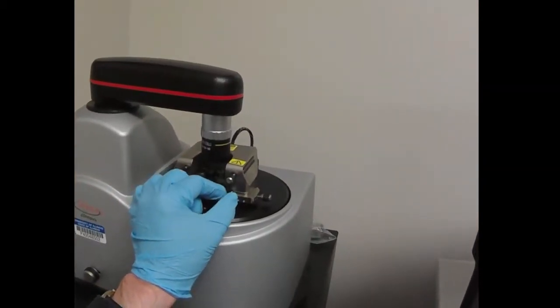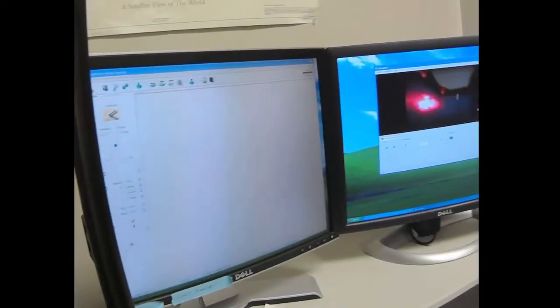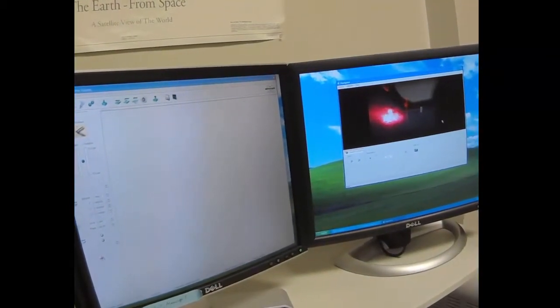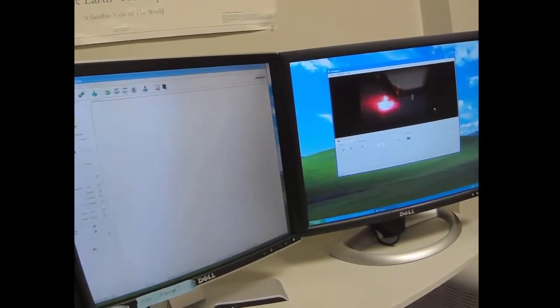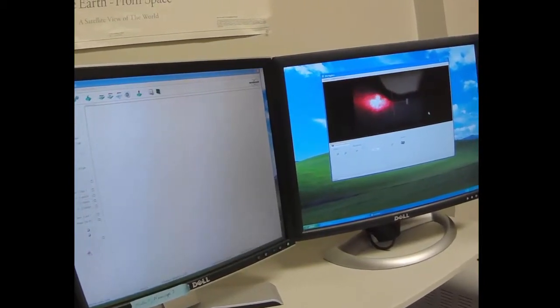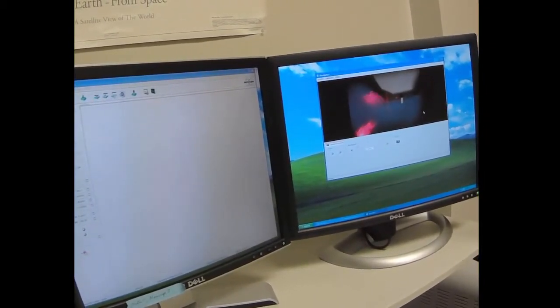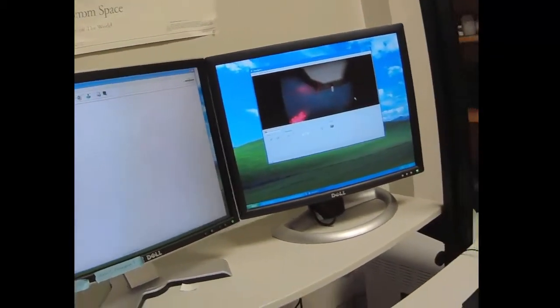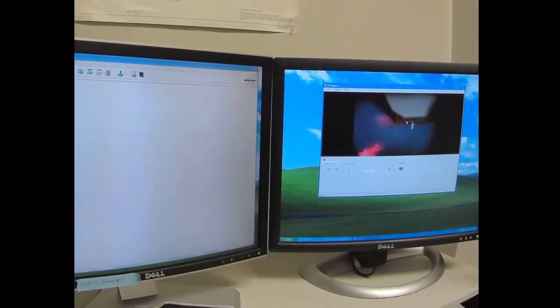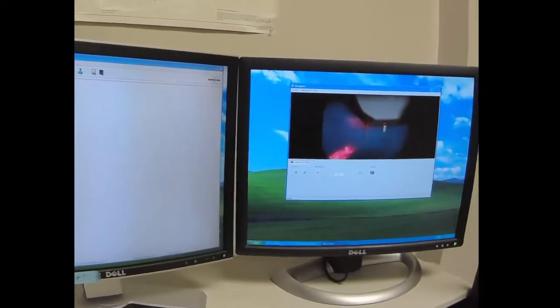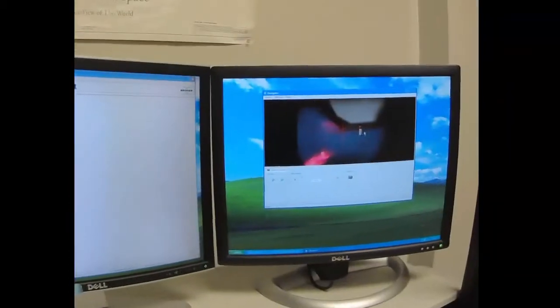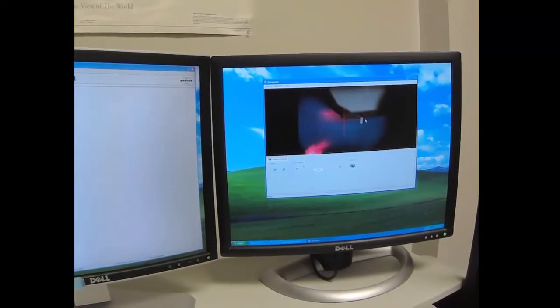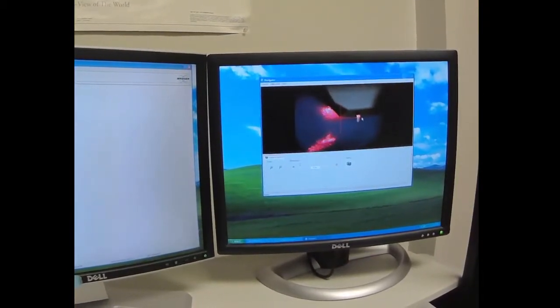These are the laser alignment mirrors here. Again, you don't have to memorize what does what. You just move it and see what happens. That moved out a little bit. Let's move it that way a little bit. I don't want to go too far because I know I'm actually close to where I want to be. I'm going to go up more until I hit the chip there. I hit the chip. Right there. So now I move. Now I'm hitting the chip and this is a bevel edge. So I'm right about where the cantilever is but a little above.